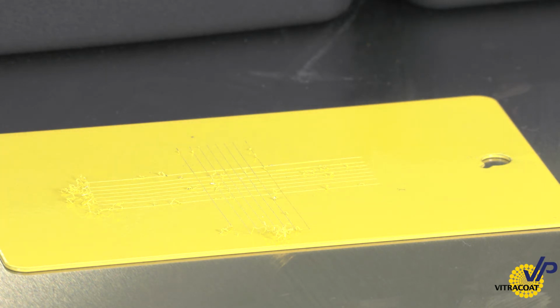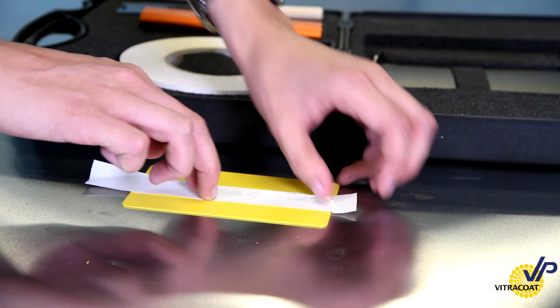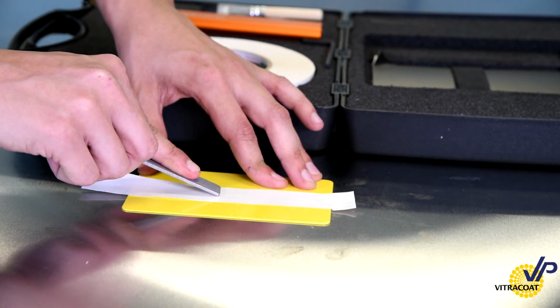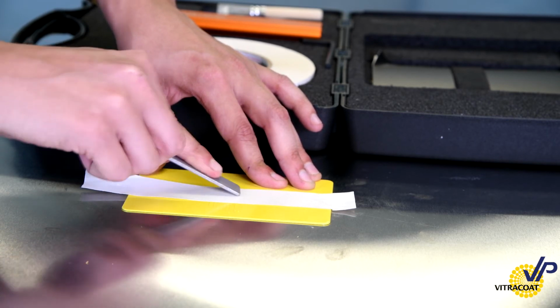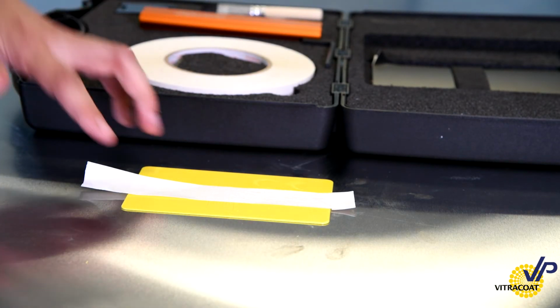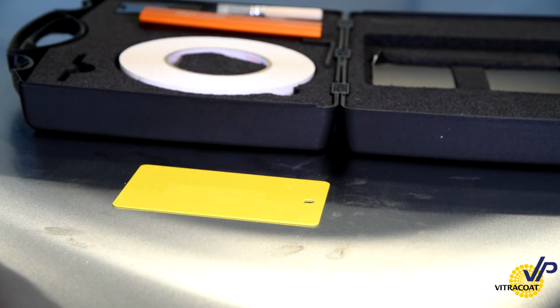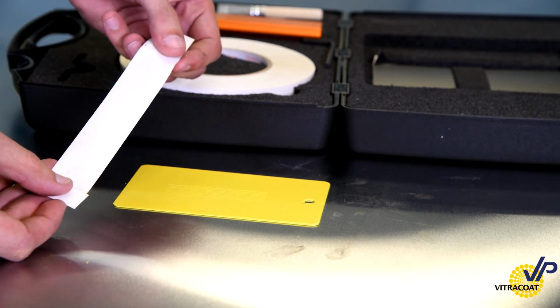After that's done, we take a specific tape and we adhere that over the crosshatched area. There's a device that we use to make sure that we get very good adhesion to the coating. So we press down on top of that tape to make sure that all of the squares are covered. After we're sure that's done, we'll pull the tape up and we evaluate it in three different areas. Number one, we'll evaluate the back of the tape itself to see if there's any lift or any of the squares have come off onto the tape.